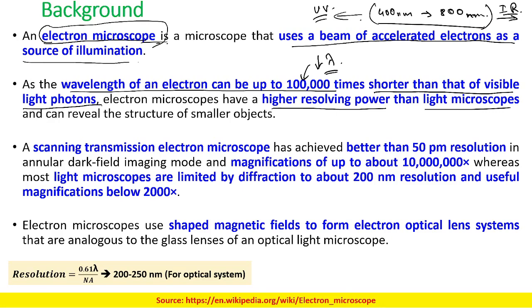In a no IR camera, you will find that there is no IR filter. In many of these modern day phones, you will find there are 3 cameras or quad cameras, right? So at least one of the cameras is given with no IR filter.